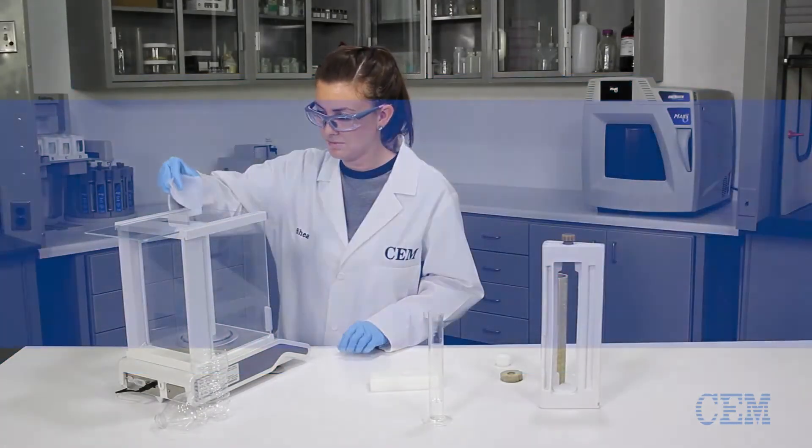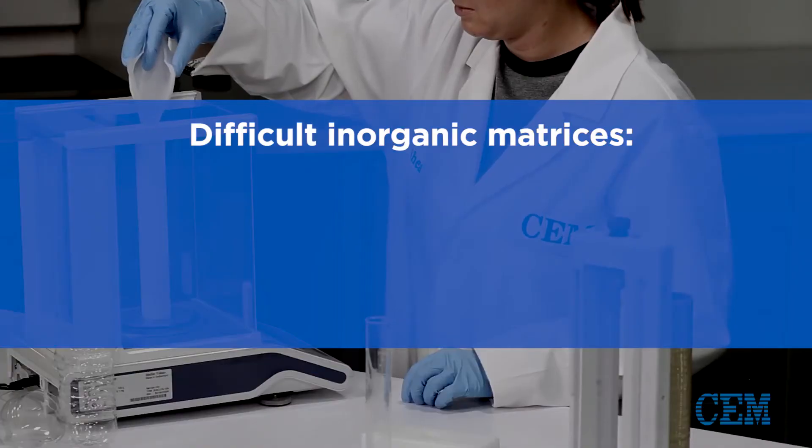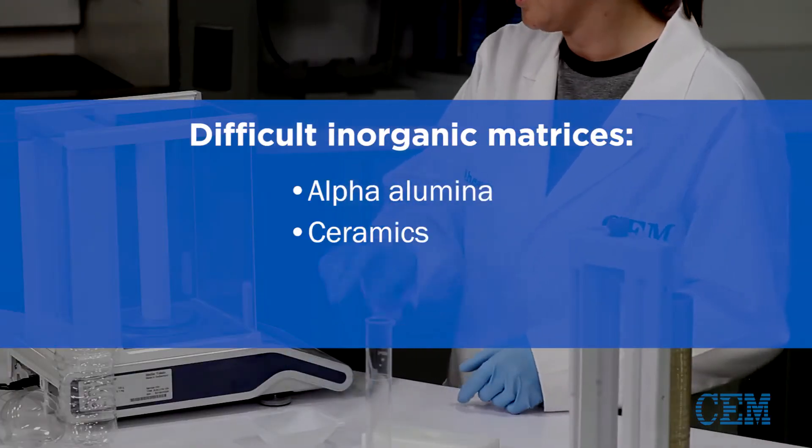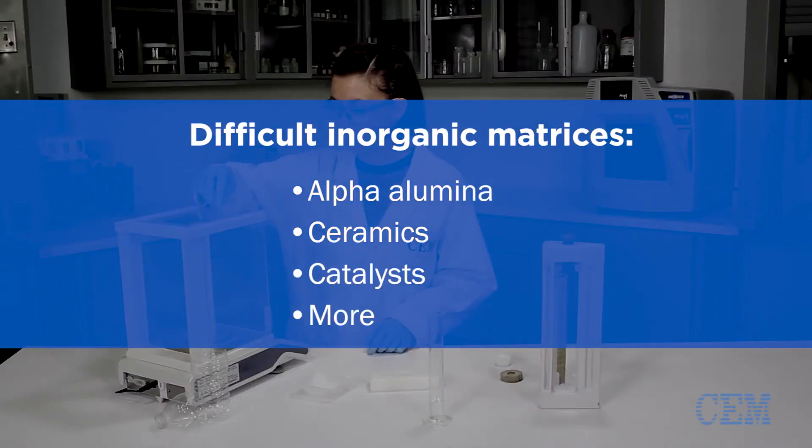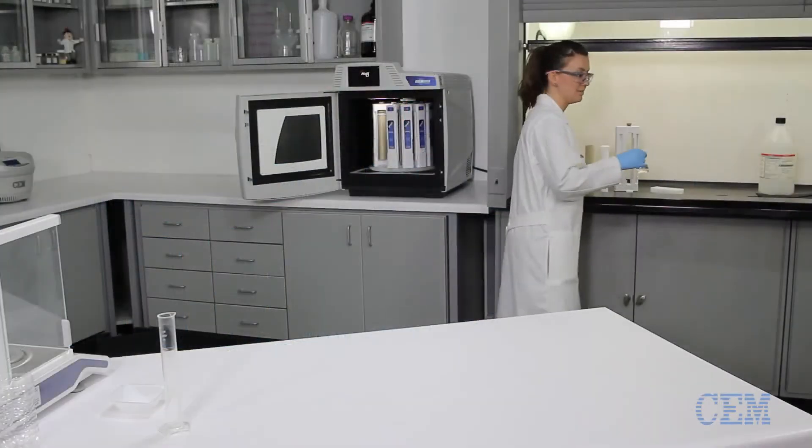I-PREP will also let you prepare difficult inorganic matrices, inorganic oxides like alpha alumina, ceramics, catalysts and more. I-PREP can prepare all of these samples and provide a clear solution of each.